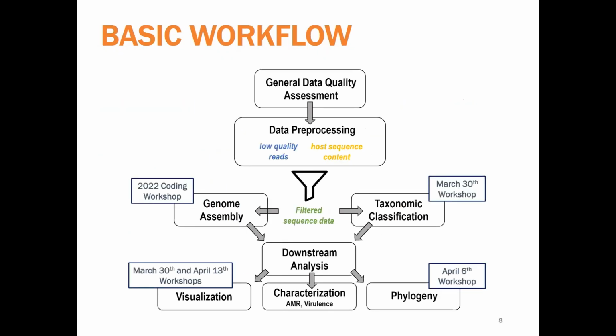So the basic workflow, building off from the workshops of this year as well as last year: you have your general data quality assessment and the data pre-processing. You filter the sequence data and perform genome assembly. There's a really great workshop from last year's MMID coding workshop that shows genome assembly if you're interested.